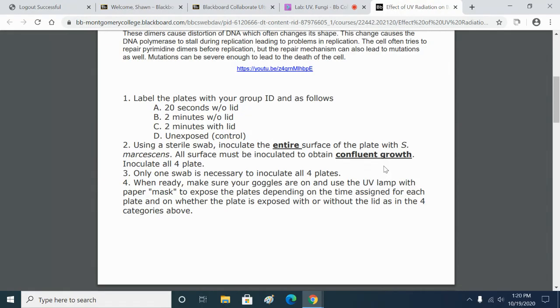And then instead of an index card, we actually do have heavy cardboard cutouts of different shapes and things. It could be stars, they could be faces, they could be X's or E's. So we do have different paper cutouts that we put over top of the plates, and then the UV light shines down through the cutout portion. And then we have to incubate the plates.